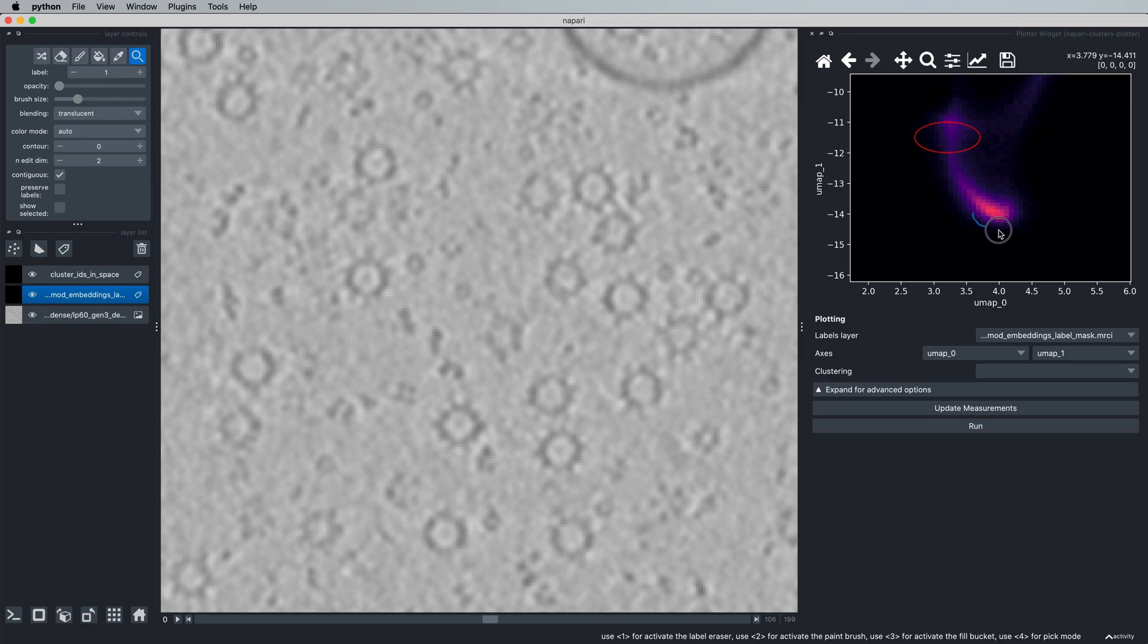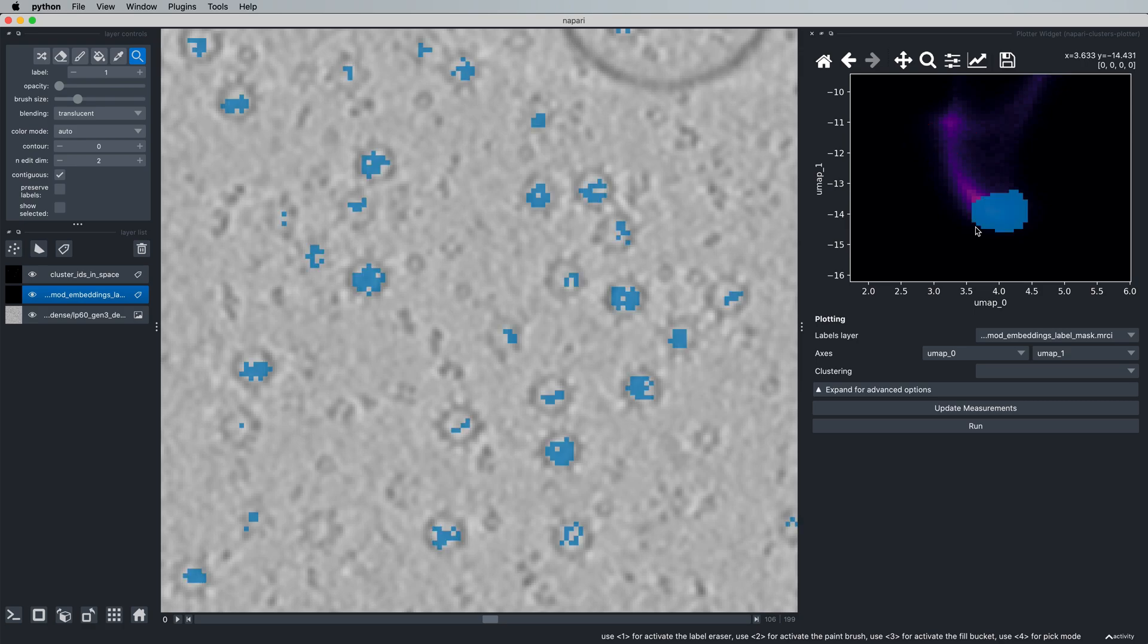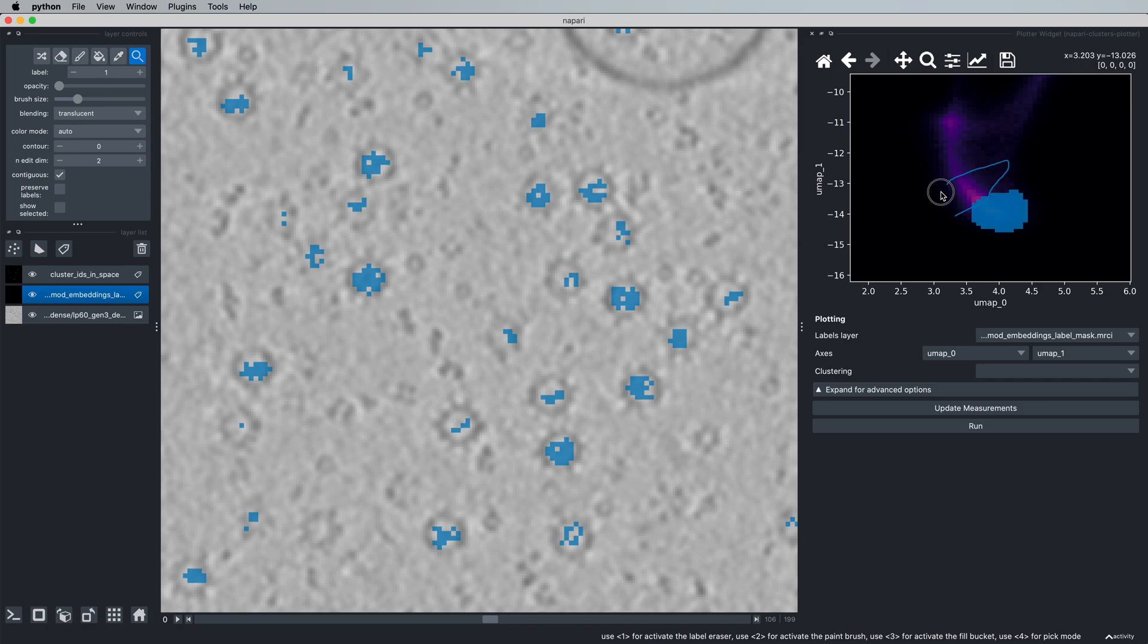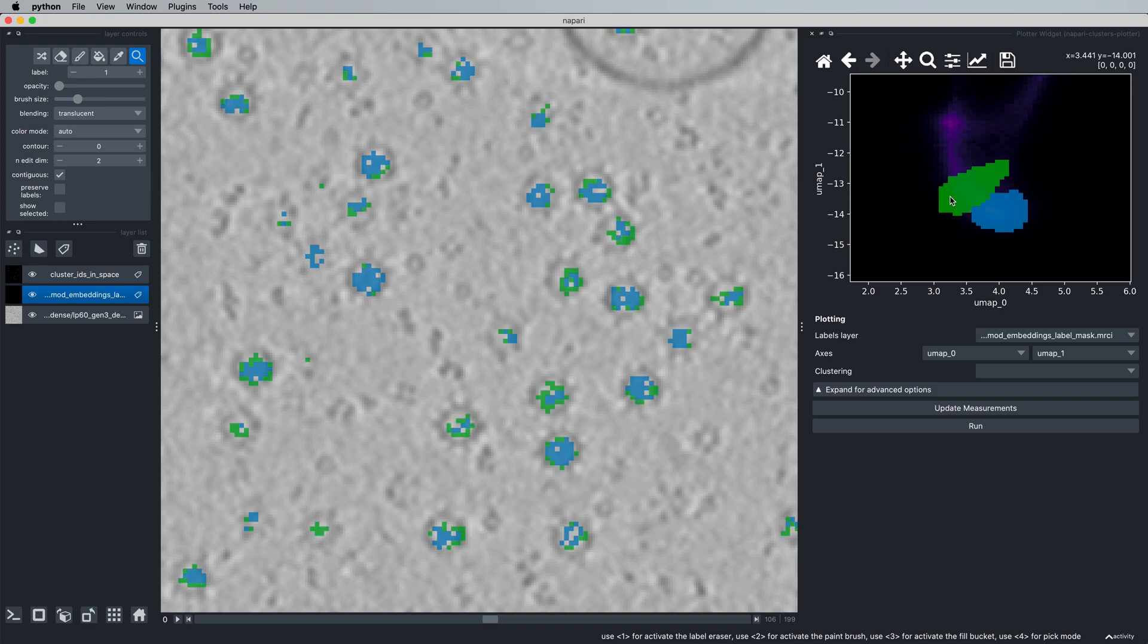And we can actually visualize this directly. So if I select this cluster here, we can see that a lot of these embeddings are in the center of the protein. If we now start to select additional clusters going further and further up this elongated cluster, let's just do that now. We'll go here and then we'll select one more up here.